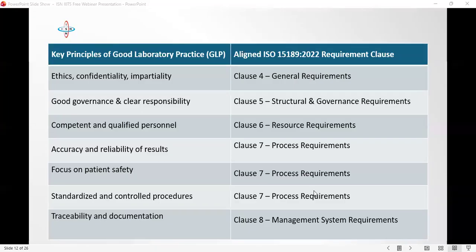The quality officer monitors, but the quality officer may not even be a laboratory scientist. If you are a person working on the bench, you are the expert. You are the one in charge from the beginning to the end. You were trained to control the environment. So it is your responsibility to document what you do, develop a process, and write SOPs for what you do, because you are the one that is competent and has the license to practice.